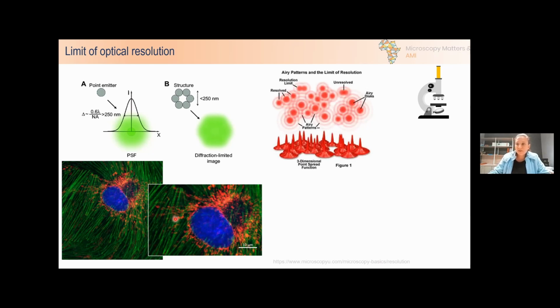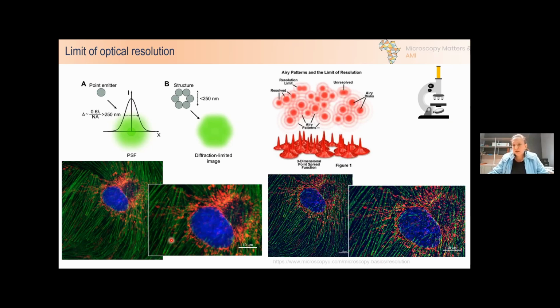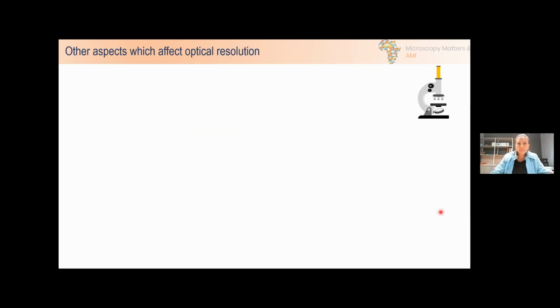Also, actin filaments might look like a single strand, but we do not know that because if the resolution is limited, some of these strands might actually consist of a lot more strands. We also do get super resolution microscopes that improve that resolution to some degree, where you can see more clearly the single mitochondria here, but it's still fairly limited in optical microscopy.